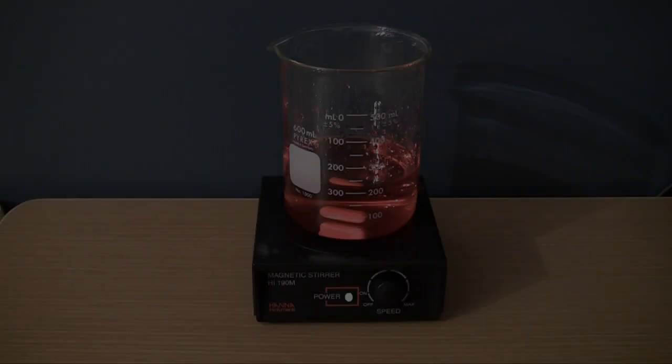What's going on guys, it's Bucky and welcome to your third chemistry lab tutorial. In this video I want to talk to you about beakers. Beakers are actually one of the most commonly used pieces of equipment in your chemistry lab. You can use these things for a wide variety of different uses.